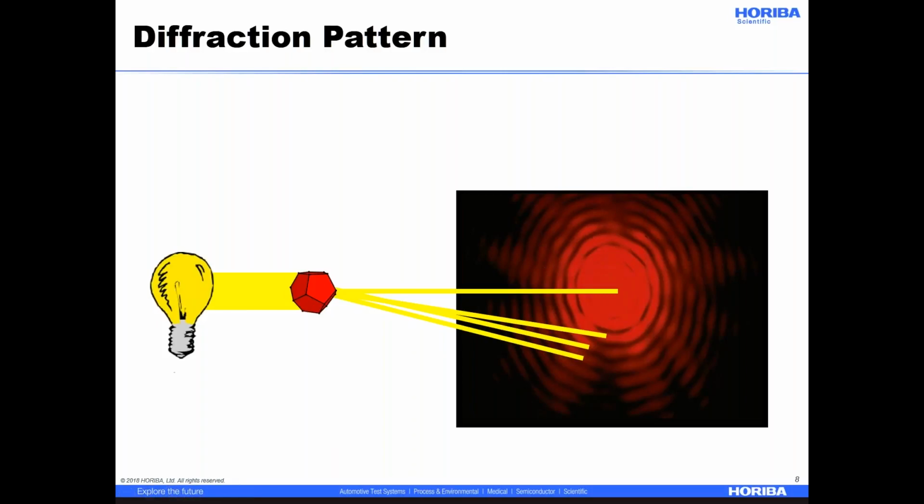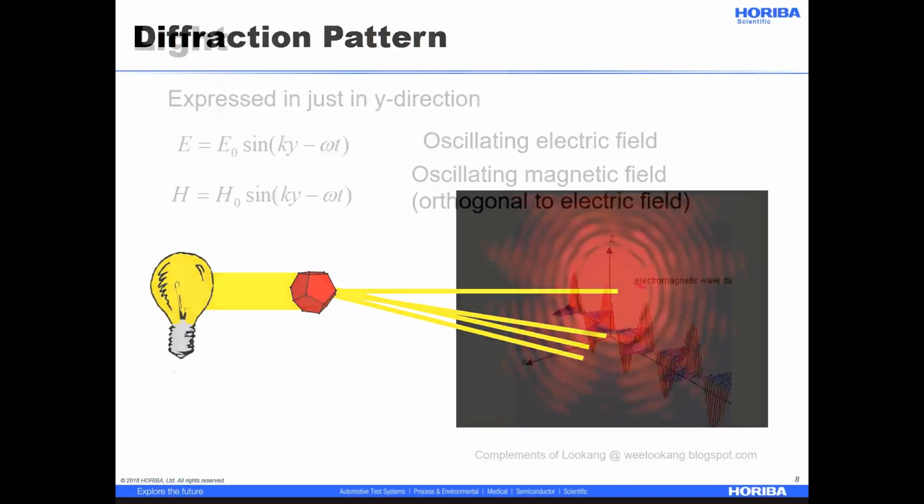When we're doing practical laser diffraction measurements for particle analysis, of course, we have particles with lots of different shapes, and they're all tumbling. And that tends to smear out these peaks and valleys, and so you get rings in your scattering. If you come out of the X-ray world, you'll think about that as kind of a powder diffraction pattern, except I don't have a regular crystal structure, which makes analysis a little bit different.